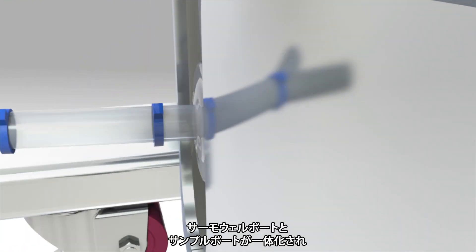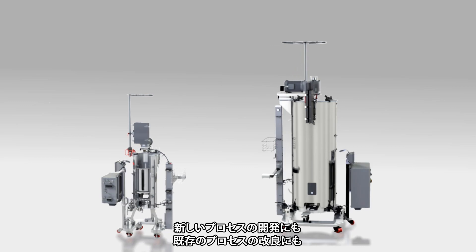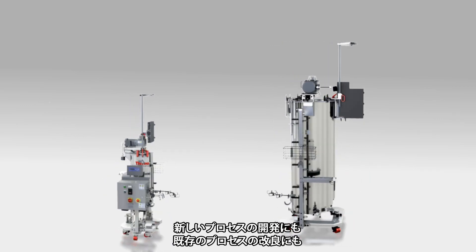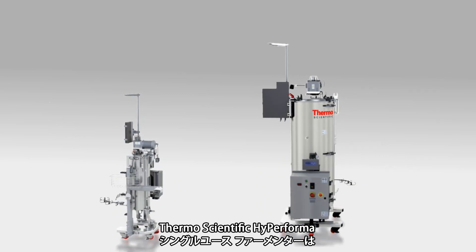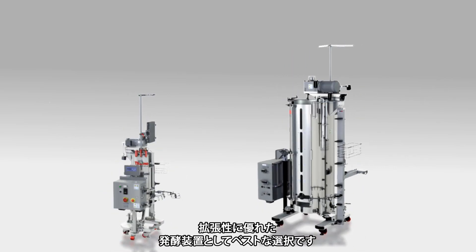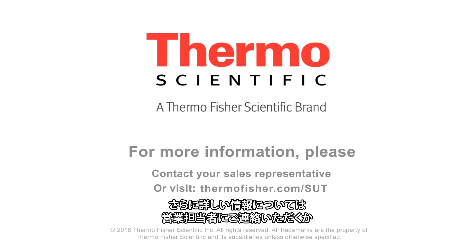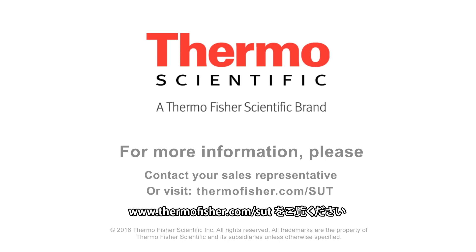Thermowell and sample port are conveniently combined into a single port and located below the probe belt. Whether you're developing a new process or seeking to improve existing processes, the Thermo Scientific HyPerforma single-use fermenter is the best choice for scalable fermentation applications. For more information, please contact your sales representative or visit thermofisher.com.